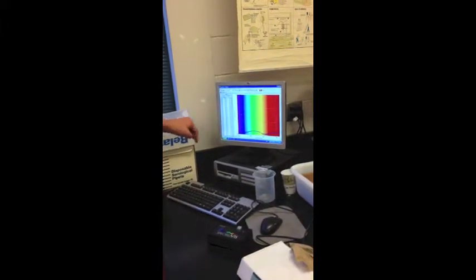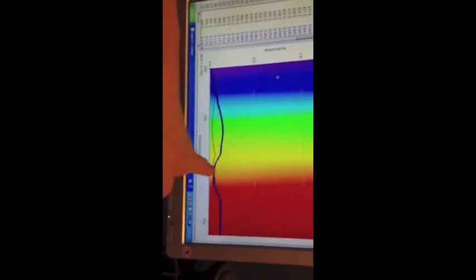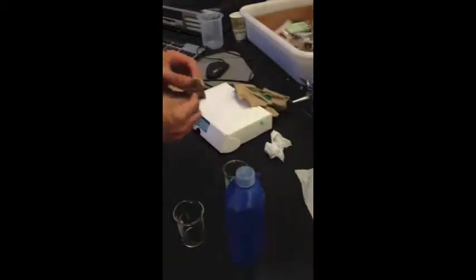And you can see that this different color is mostly distilled water and red food coloring. You can see that the absorbance spectra is different as opposed to the other one. Alright? And one more for fun. We'll combine these two solutions and we'll see which one it looks more like.